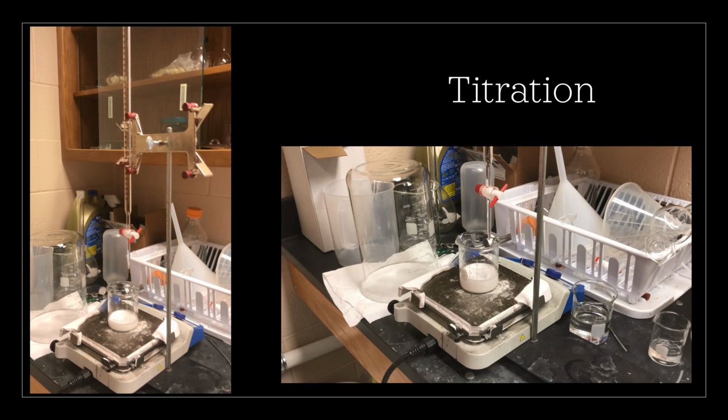The second type of titration that needs to be performed is to determine the organic feed acid concentration. For each new batch of feed, a sample must be collected from the organic feed tank. To allow the aqueous color indicator to disperse throughout the sample, add a small amount of surfactant to the oil, then perform the titration as normal.